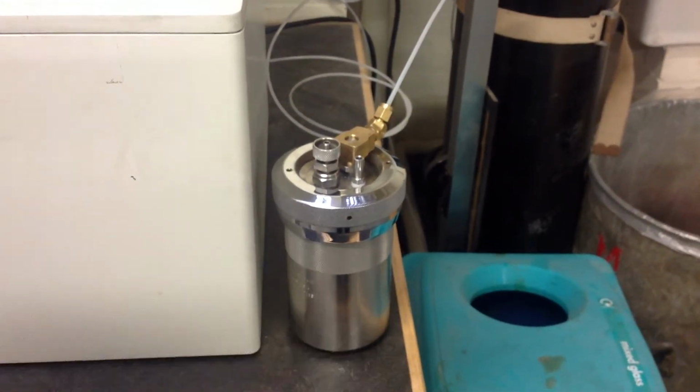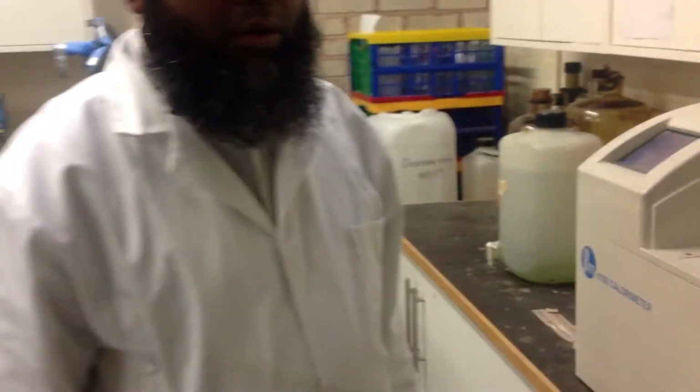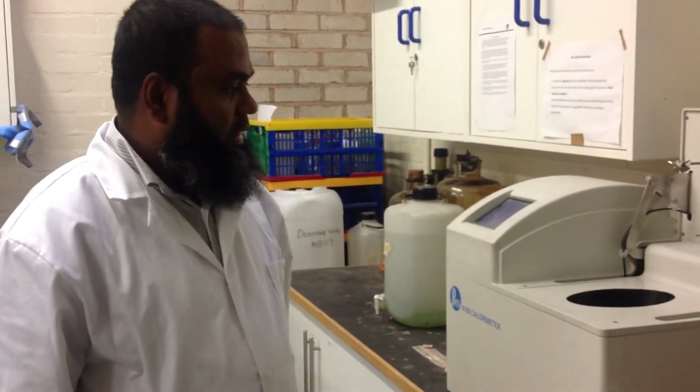When the oxygen filling is finished, the software will tell us. So let's wait for the oxygen filling to finish.